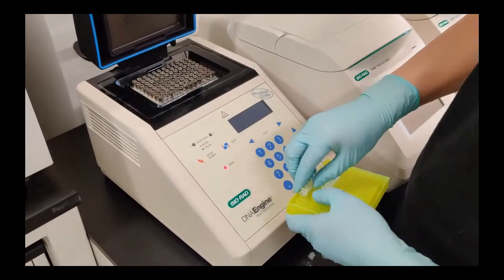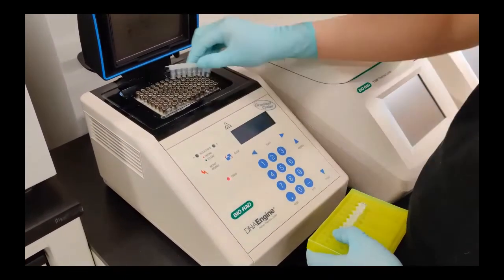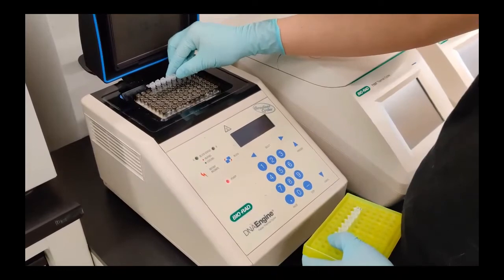Then, we put the samples into a machine called a thermocycler. This sets the temperature for PCR to happen.